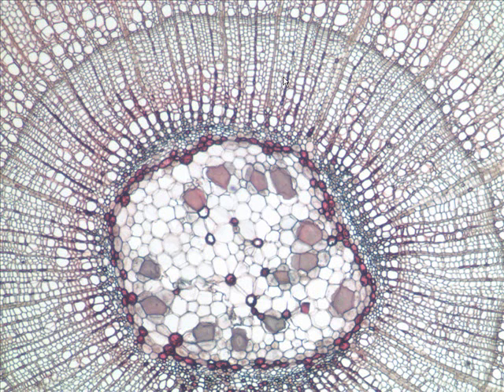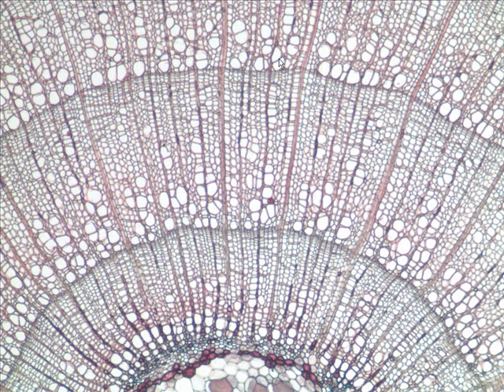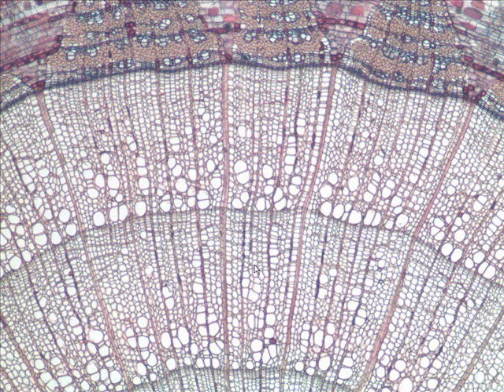Actually, botanically, it's called what? Secondary xylem. Actually, we have 3 rings. That's how we know it's a 3-year-old stem, right? And so, is this one toward the middle the oldest or youngest ring? Yeah, it is. That's right. Let's keep moving out a bit.